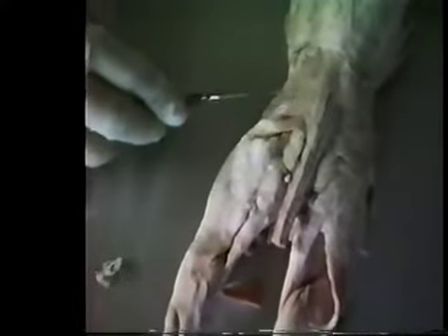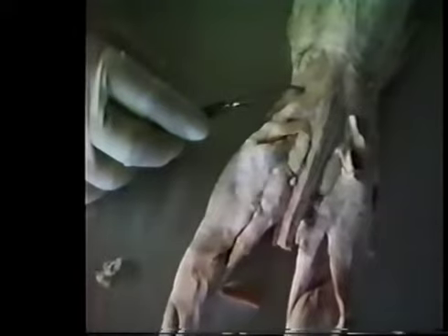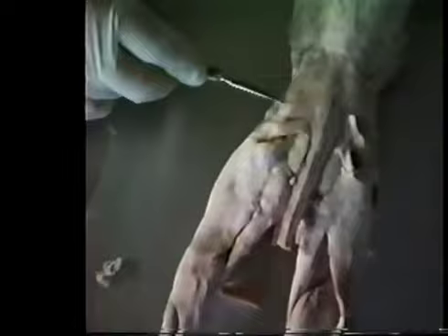We can separate them here and see them clearly. This muscle is the gluteus medius. Below that is a smaller gluteus maximus. Then the caudofemoralis. Gluteus medius, gluteus maximus, and caudofemoralis.